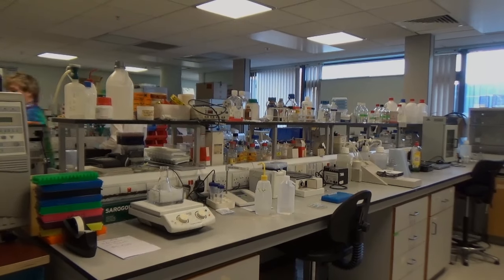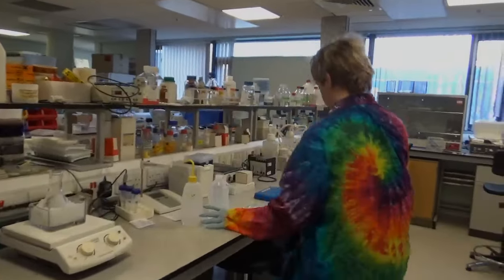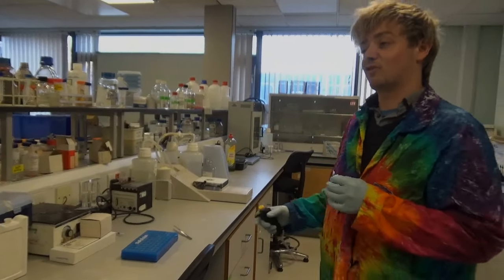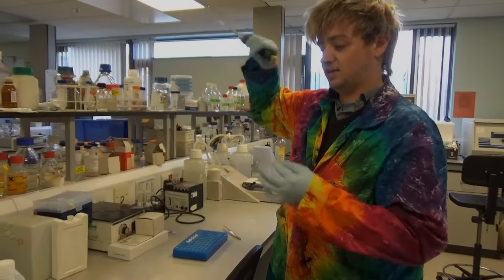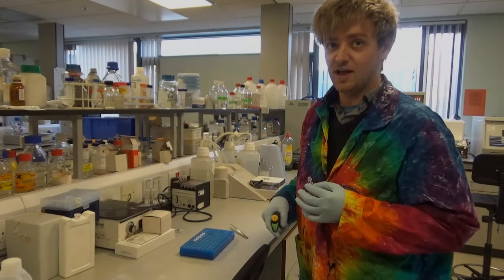are little sequences of DNA which I'm trying to attach to my electrodes so that I can analyse samples of another thing called microRNA, which my DNA attaches to. So I put the DNA on here, I then run a scan over there, and the microRNA attaches to the DNA and then it changes the voltage.